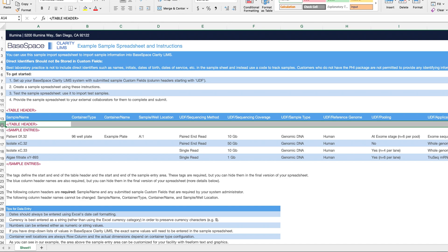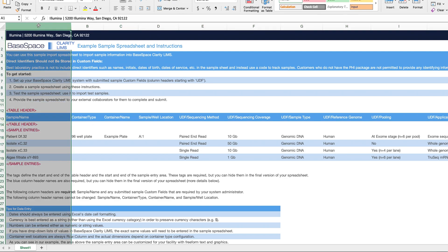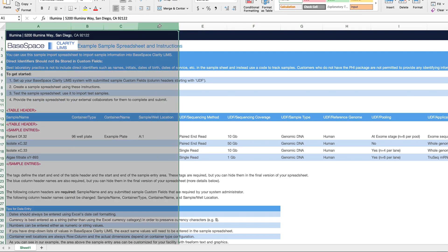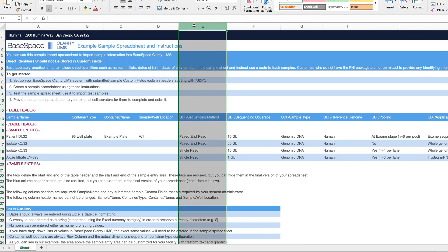Columns A through D are mandatory. All of your samples need a name, a container type (for example, 96-well plate), a container name, and a location on the plate if there happens to be one. Everything from column E to the right is referred to as custom fields.